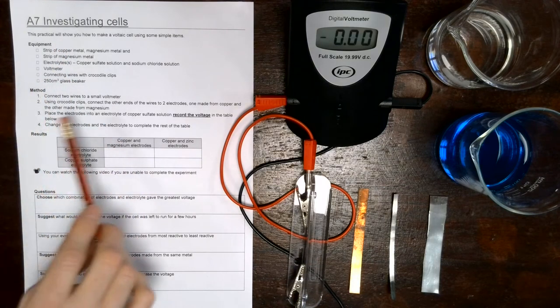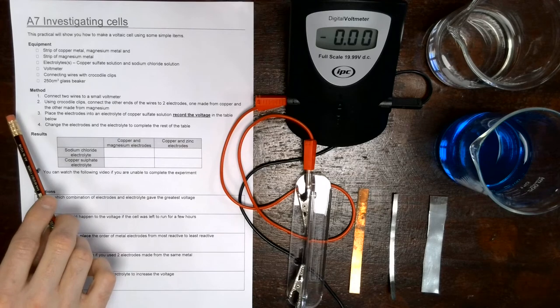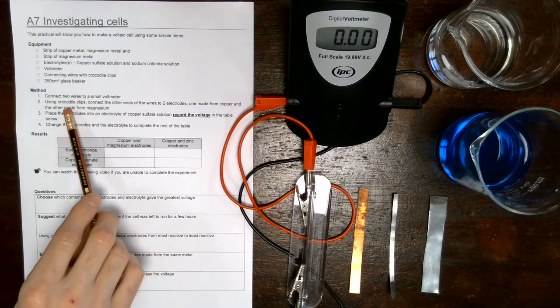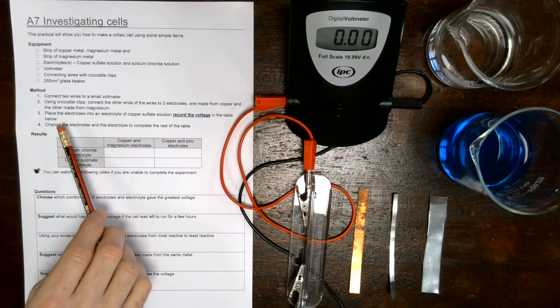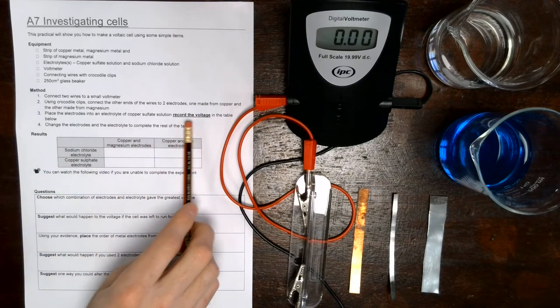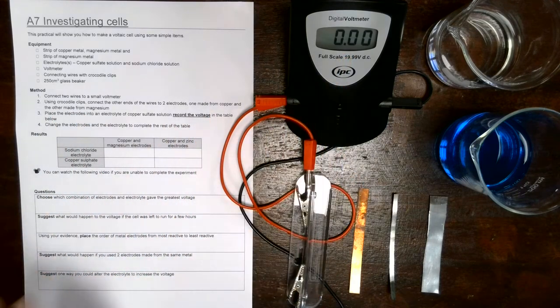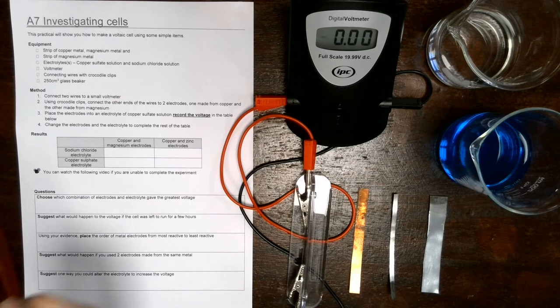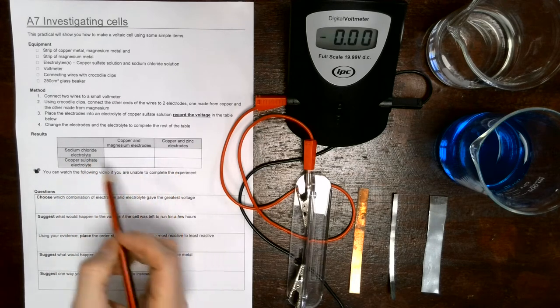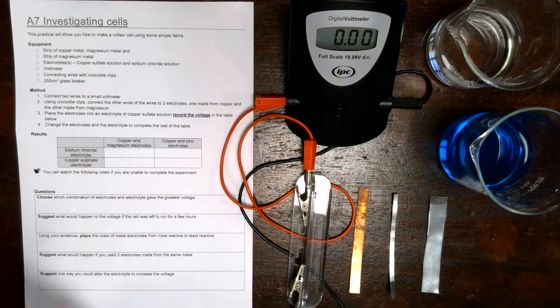Once we've gone through the list of equipment, let's have a quick look at the method. So we're going to choose two different metals, connect them to the crocodile clips, and then place them into one of the electrolytes and record the voltage that's going to be displayed here on the voltmeter. All we need to do is complete the table by matching the electrolyte with the different types of electrodes. So let's get started.